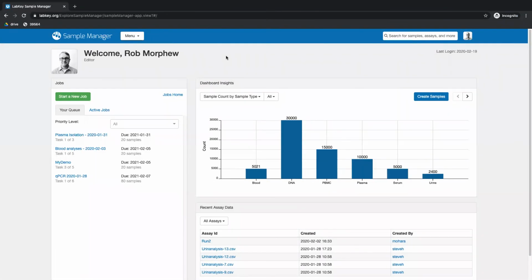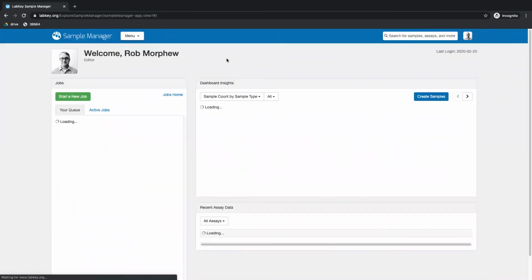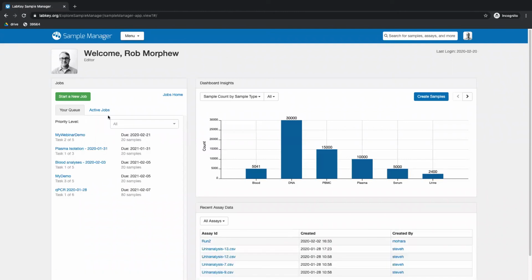And if I refresh this page here, we'll be able to see that Rob now has a new job in his queue that is my webinar demo.